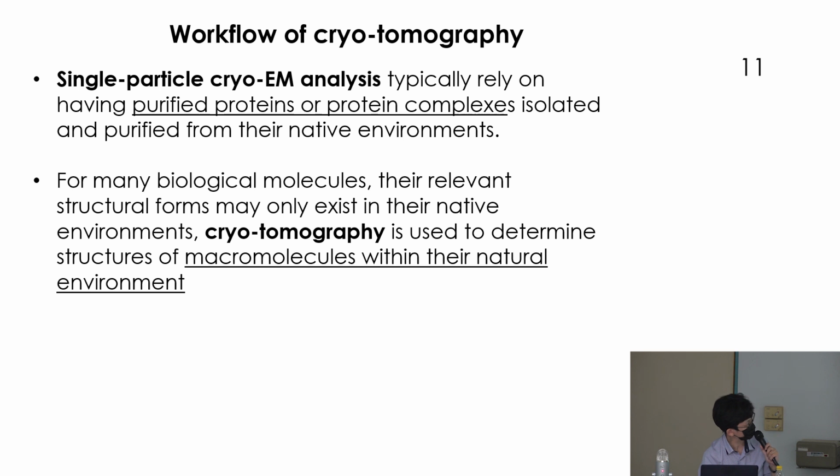So far, single particle cryo-EM analysis is still the mainstream in the field. But this one is catching up. It has a lot of potential and a lot of advantages we'll talk about later. But for single particle cryo-EM, like the word says, you need a single particle, which usually means a purified macromolecular complex also. So the sample has to be purified in order to obtain this homogeneous single particle.